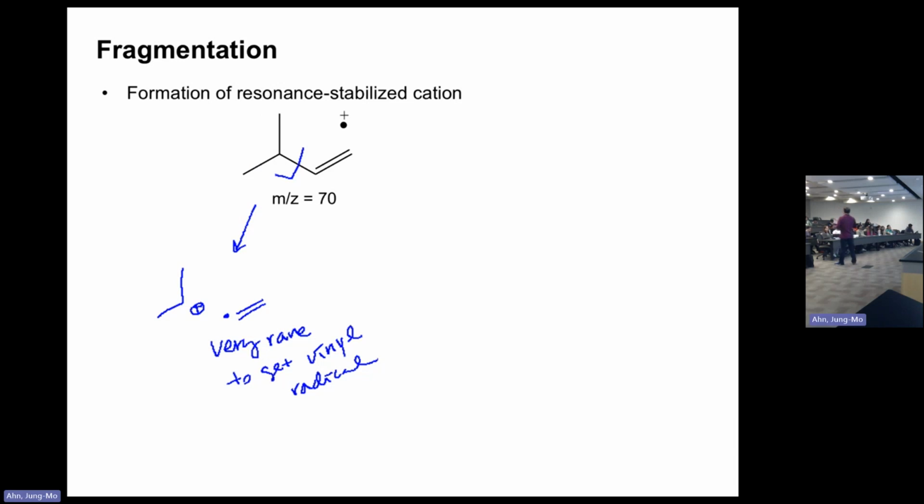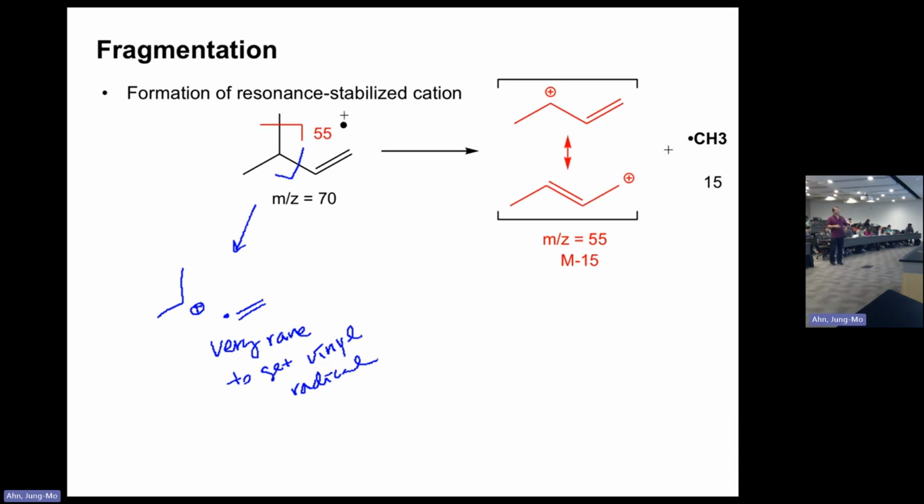Things that we've been talking about. Taking off the methyls is so bad. It makes a methyl radical. Methyl radical is bad. I've been saying it all the time. If you just memorize that, then you're not going to take the methyl groups off because that's a bad thing. But everything has to be taken as a whole. You have to think about breaking that one off. That methyl off, yes, that's going to make the methyl radical, which is bad.